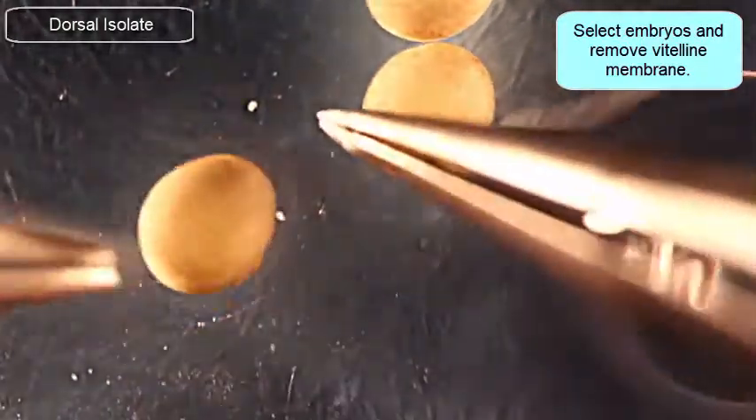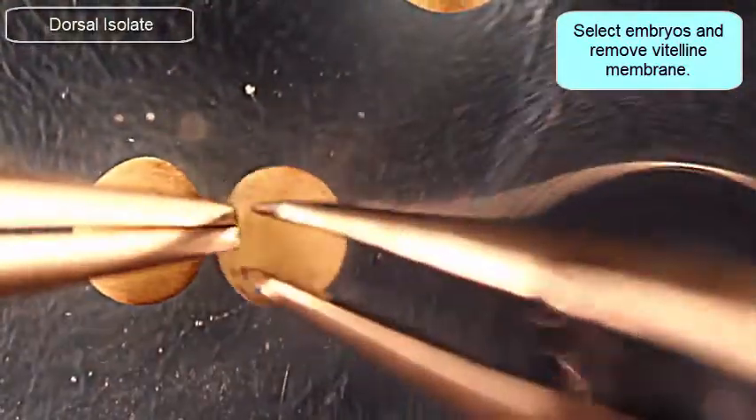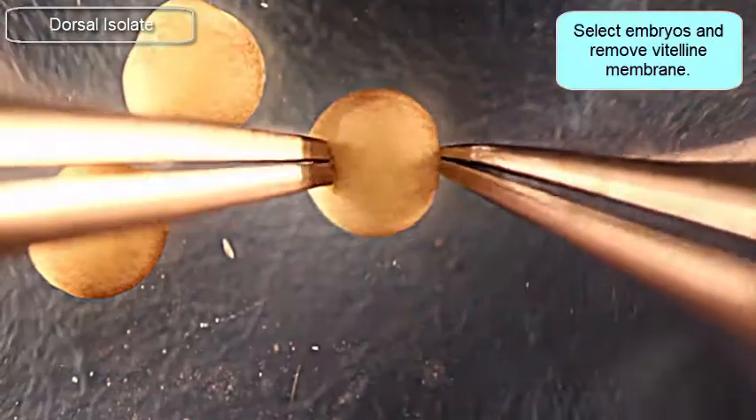I could do it a little bit later — all the way up to stage 21. In particular, they need to have a well-defined archenteron before you can go ahead and isolate the dorsal isolate from these.